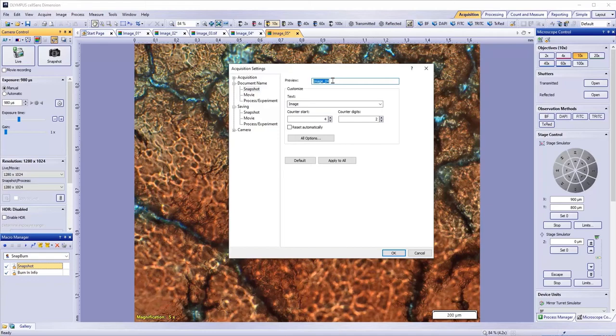The prefix will be followed by a count number that advances every time you take a snapshot. Even if you close the program and restart it, the counter will pick up after the last image you snapped.